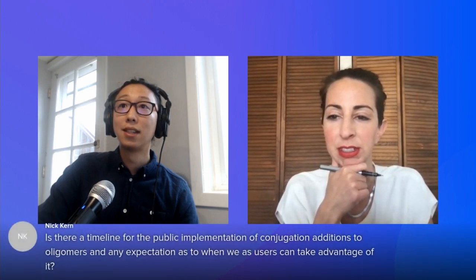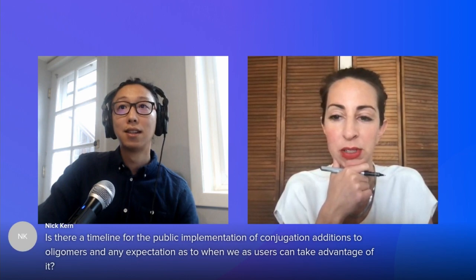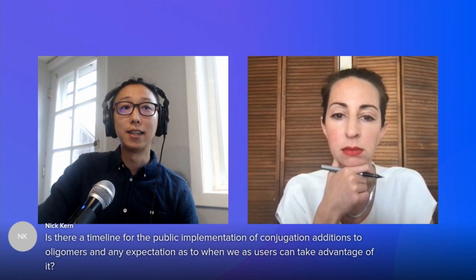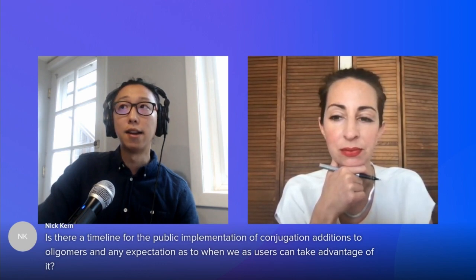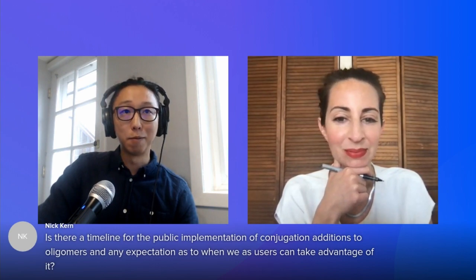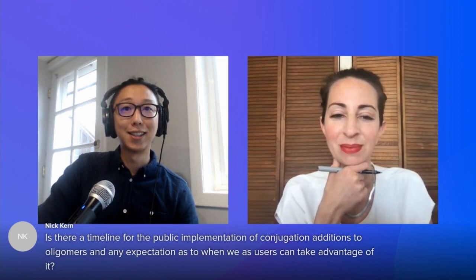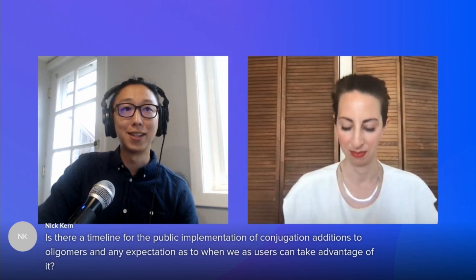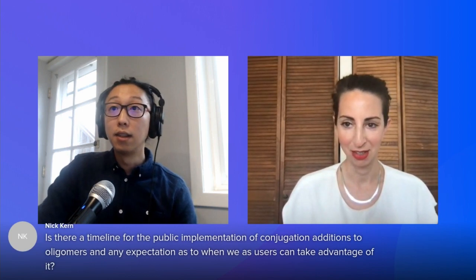Nick has a couple questions for us. Is there a timeline for the public implementation of conjugation additions to oligomers, and any expectation as to when users can take advantage of it? Yeah, so this is actually in flight and almost ready for public access now. Conservatively, I would say we're a month away, but realistically, probably shorter than that. So we would definitely like to follow up with you offline too, and can let you know when we do release those capabilities. So stay tuned.